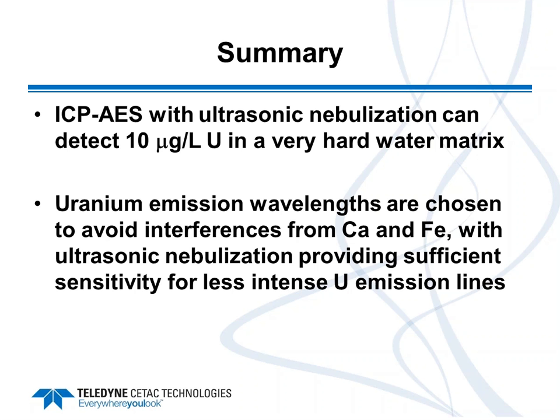So the solid matrix, like the salt, is not removed. In order to do that, you'd have to move to a sample preparation technique like chelation in order to chelate the elements of interest and remove things that you don't want, like sodium, potassium, calcium, and magnesium.